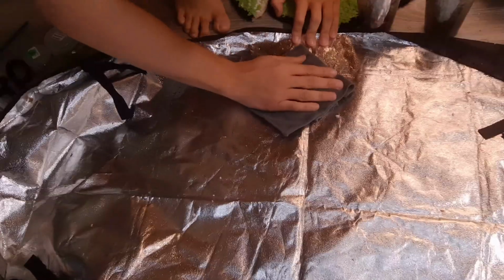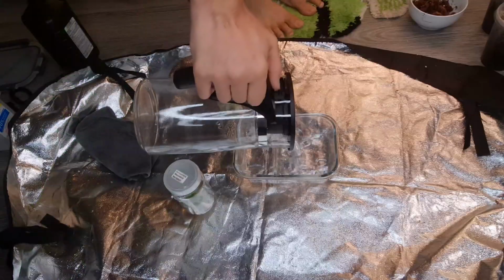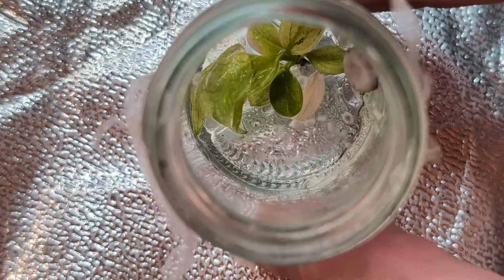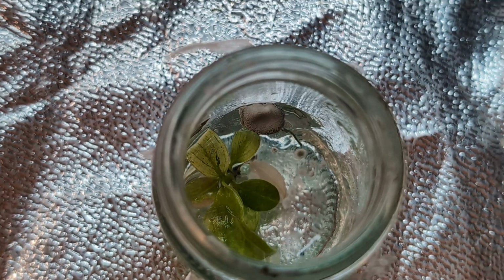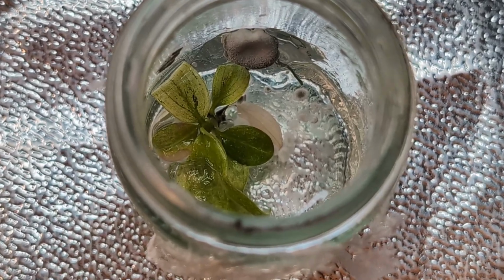So the first thing you need to do is just clean your surface. I use alcohol, wait 30 seconds and then wipe it clean, and then get some water for whatever containers you're going to use for the process, or the faucet works. Then remove the plant as quick as possible. I took my time because I wanted to show you the mold and how close it was to the plant, but ideally you wouldn't leave the lid open so long. You just want to get it in and out.